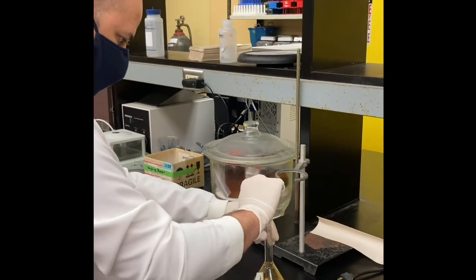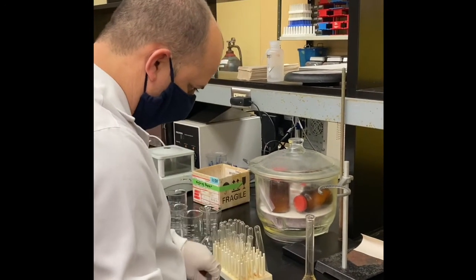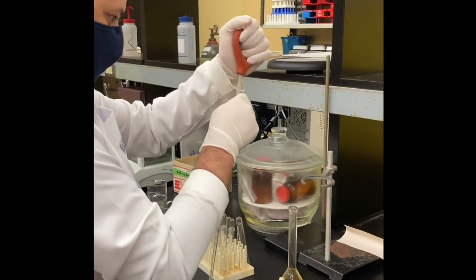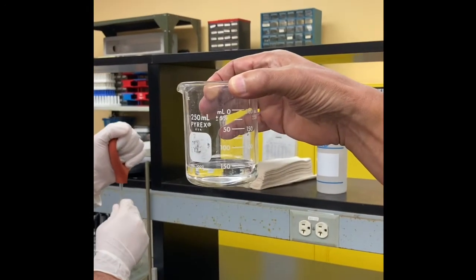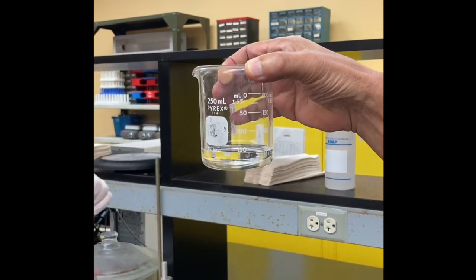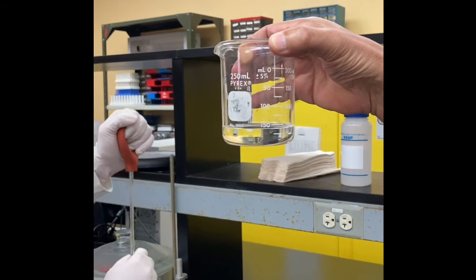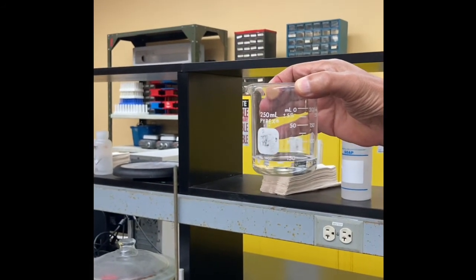Okay, so now we have our stock solutions ready, and we already mixed 10 milliliters of HCl stock solution, 10 milliliters of acetone solution, and 20 milliliters of water, which corresponds to our solution number 1.